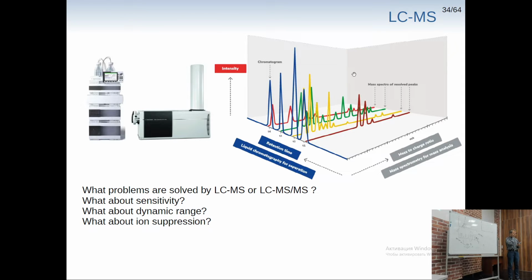Oh, I'm sorry. So, if we just sum up all the masses of all the possible variants of chemical structures with those elements, what we get is that the possibility of finding them at different m over z is not the same. We'll have some groups at which just the sum of elements can provide us with something that is peptide-like.